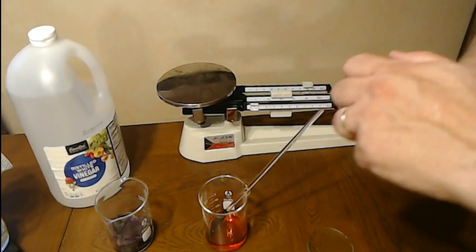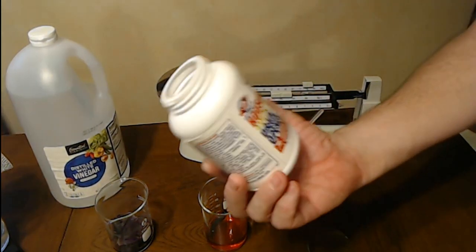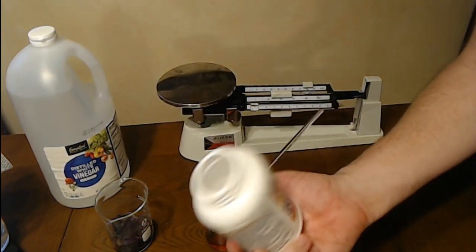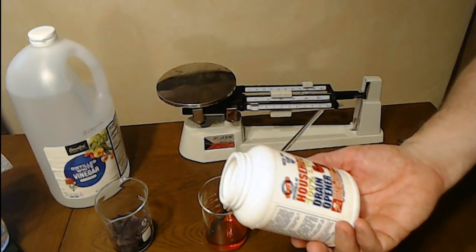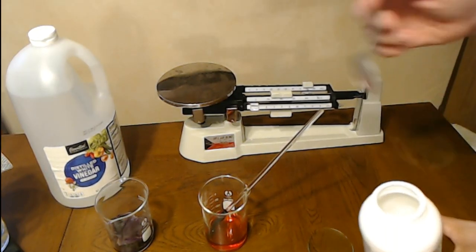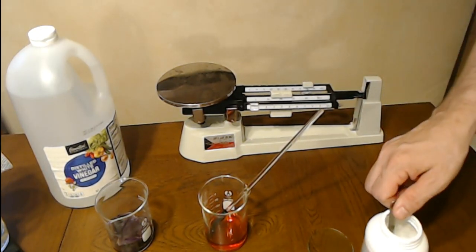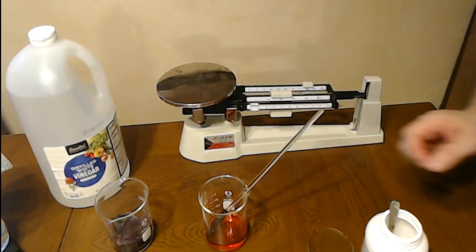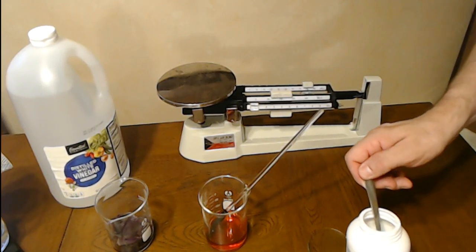Lye has some safety concerns. It is a very caustic base. It can burn you. Generally, this lye is solid. Generally it would only burn you if it's liquid, but it can sit on your skin for a while and absorb some of the moisture from your skin and turn liquid and start burning. The lab says to use gloves, but I'm like 4 feet from my kitchen sink, so I can always rinse off if I need to.